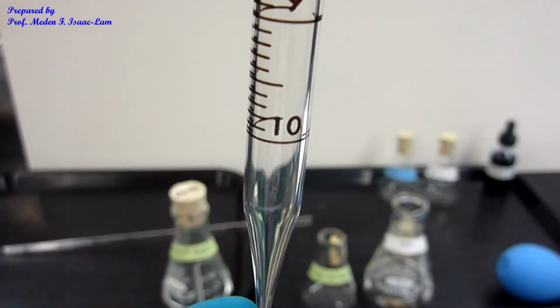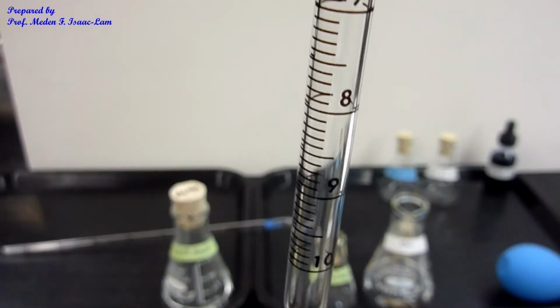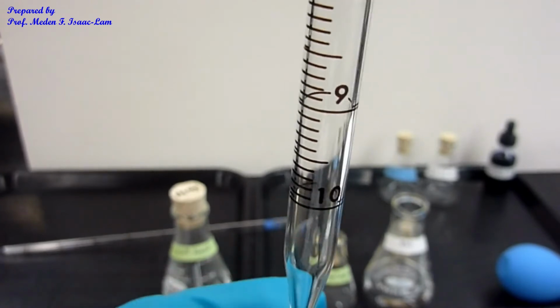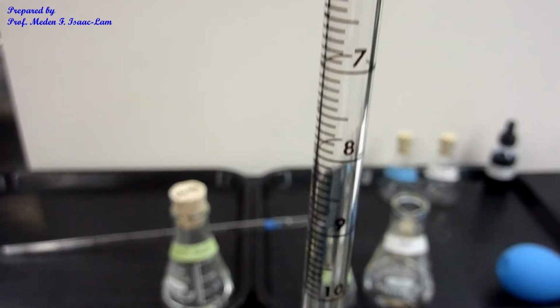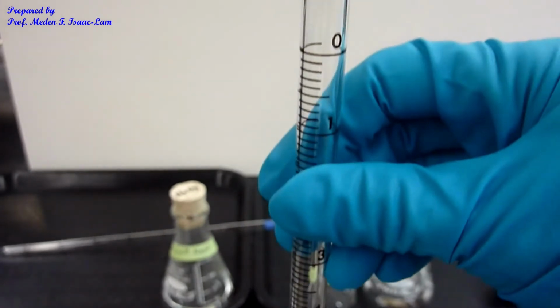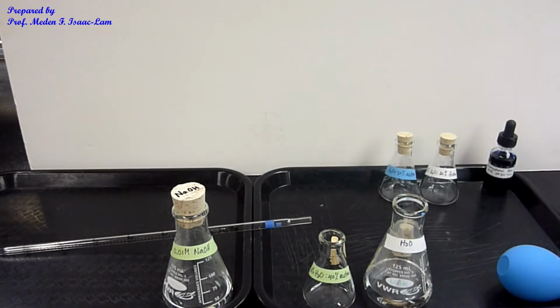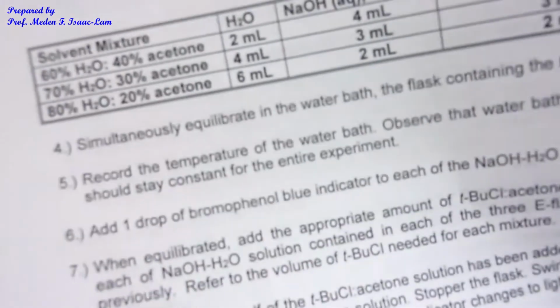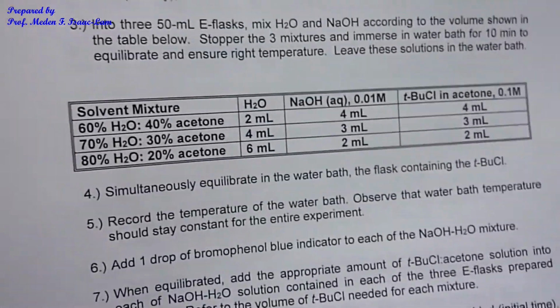Don't deliver up to the end. That's one of the things that you have to be careful about when you're using a straight pipette, because it's not to deliver. So now I'm going to measure 2 mL.